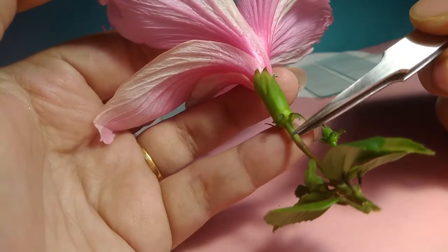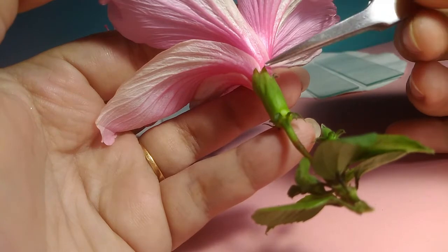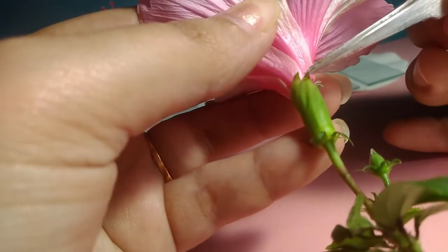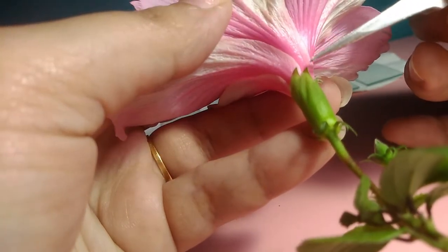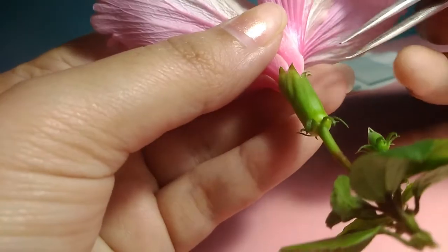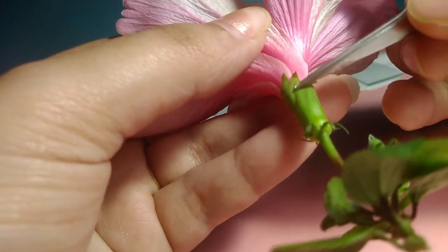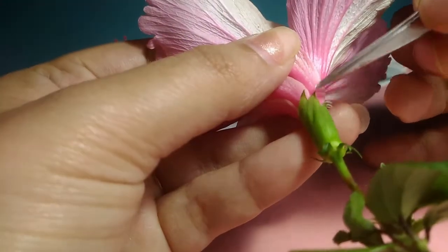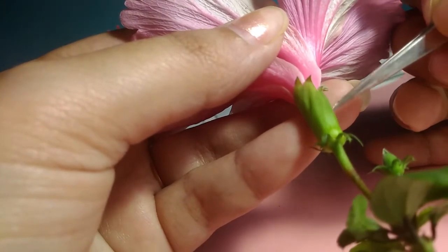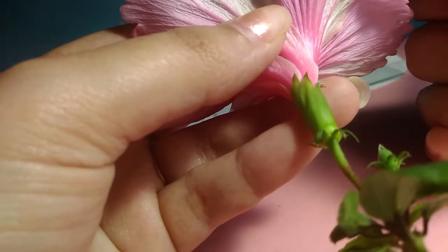Okay, so above the pedicel, we have this green sheath-like structure which is known as the calyx. And each unit of the calyx is known as the sepals. These pointed tips, these are actually the sepals. Can you see here that each of these sepals are actually joined in case of this plant? This plant is hibiscus. And in hibiscus, we find that the sepals, these pointed things, these are all joined together, isn't it? We have one single structure here. So these sepals are all joined together in hibiscus.